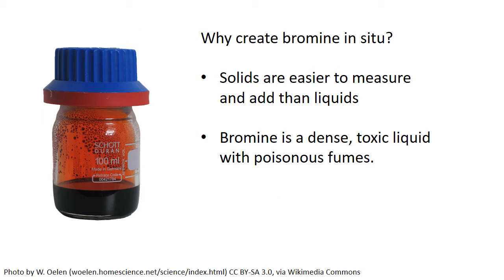However, we are not going to use these conditions that you see in the textbook. The reason is bromine can be a little difficult to handle for undergraduates. It's a liquid with noxious fumes and quite toxic. Now, we will be using 48% HBr, which is no joke, but it should still be a little bit easier to handle than bromine.